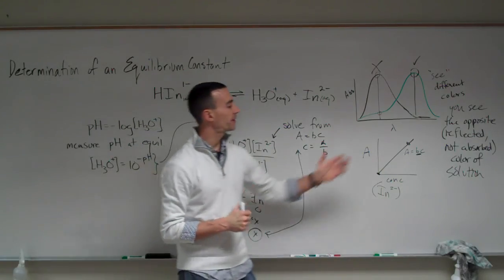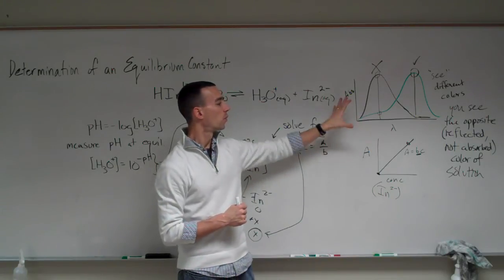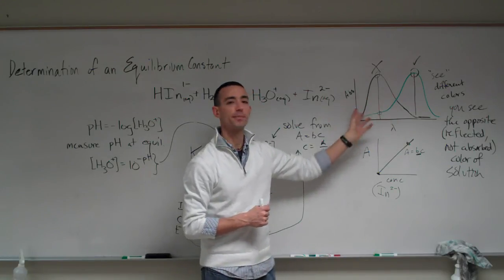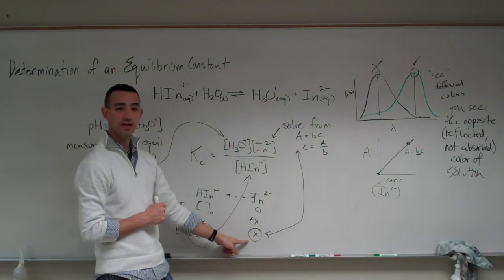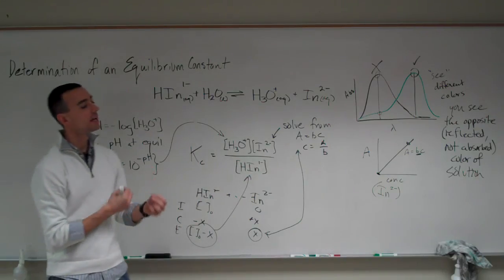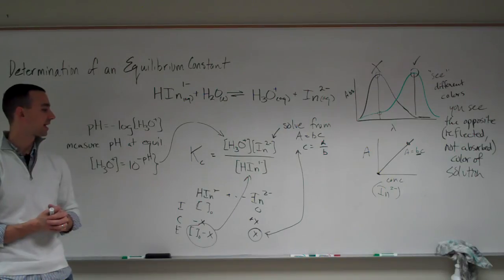Our UV-Vis spectrometer needs to be zeroed out at the appropriate wavelength once you've decided which one you're using. Again, if it wasn't, then you would have a systematic error in your absorbance values, which would lead to a systematic error in the concentrations of IN-2. So you can see how these things propagate if you're not careful in following your procedures. They lead to these systematic errors.